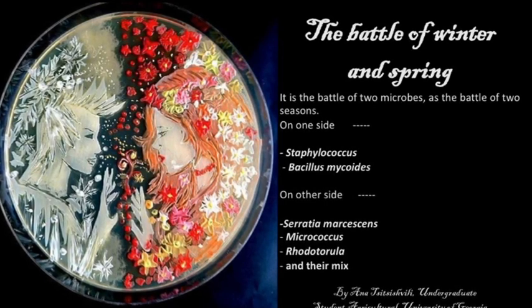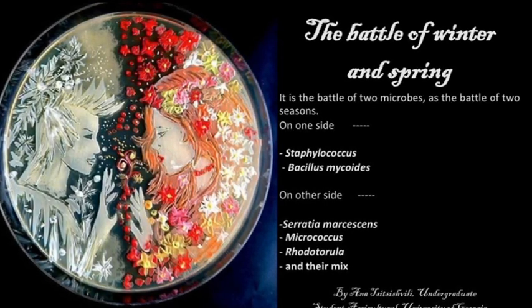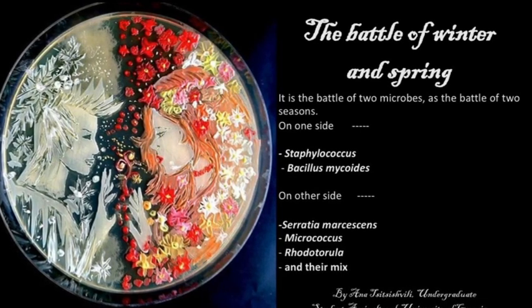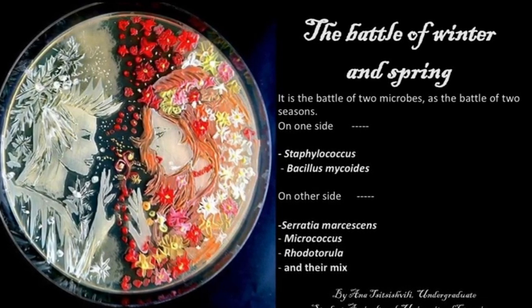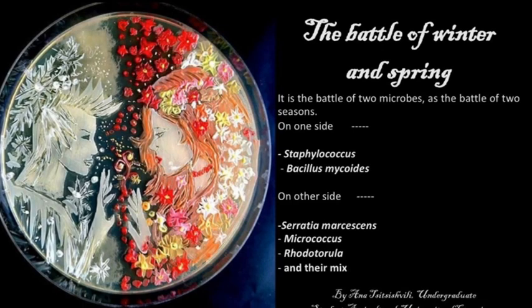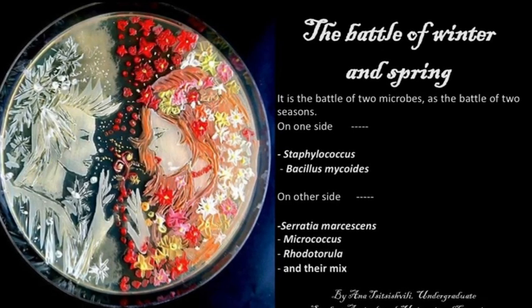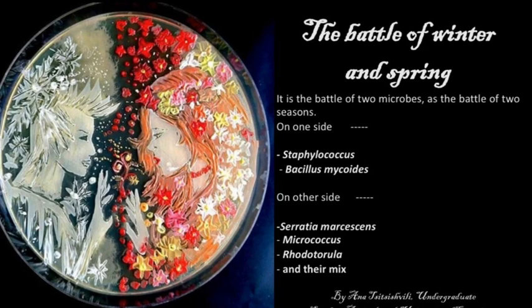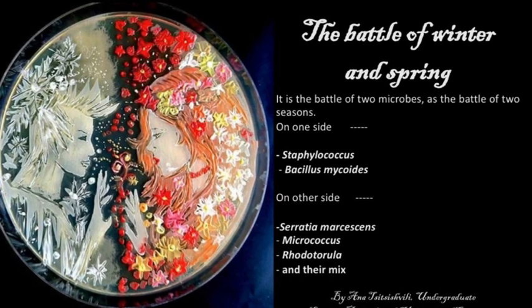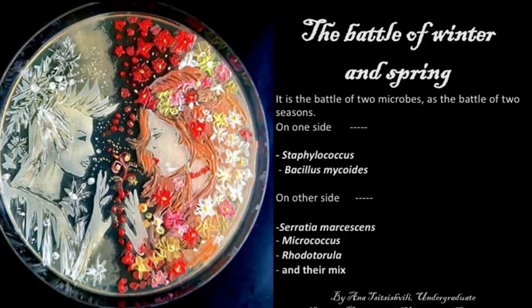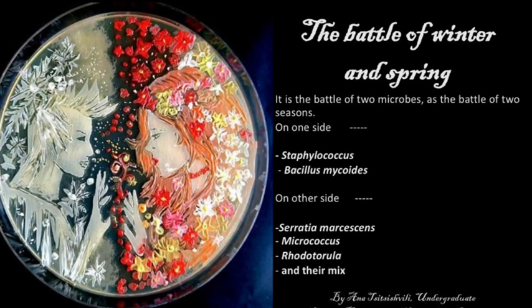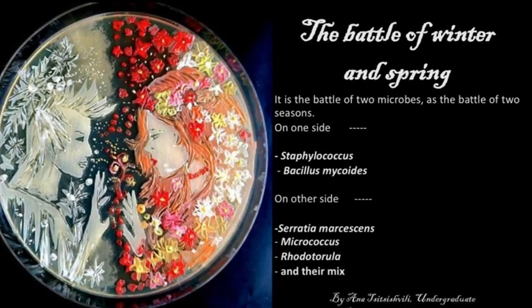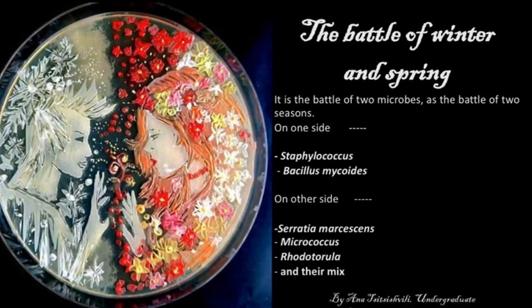Antibiotics produced by Serratia inhibit their growth. They melt, as worms of the spring melted the snow. On the other side of the plate, spring wins. Flowers of resistant Micrococcus and their mix are growing so fast. As after winter, always comes the spring and nature awakes.